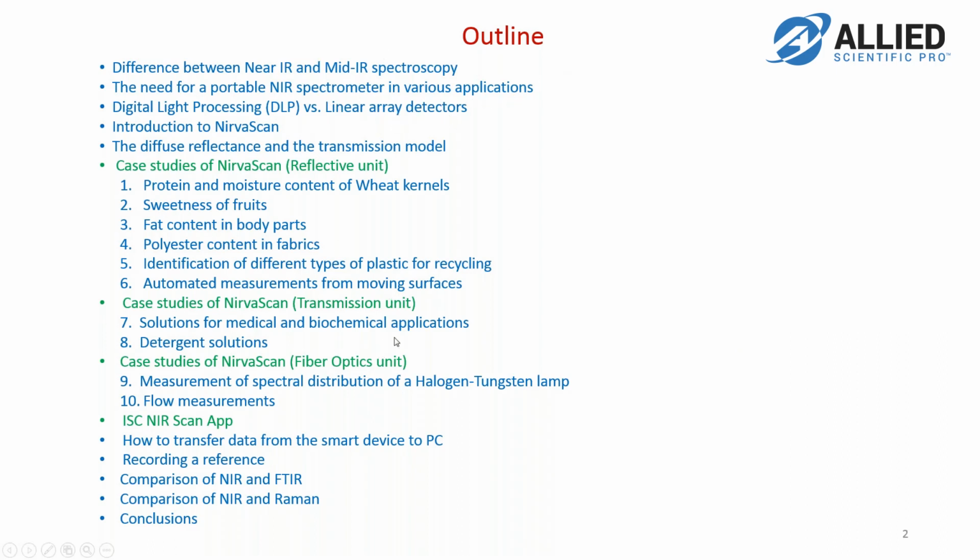Then I'll explain the digital light processing technique, which is different from the traditional dispersion method for spectrometers using linear array detectors. Then I would introduce the NIRvascan instrument and the different models of NirvaScan.